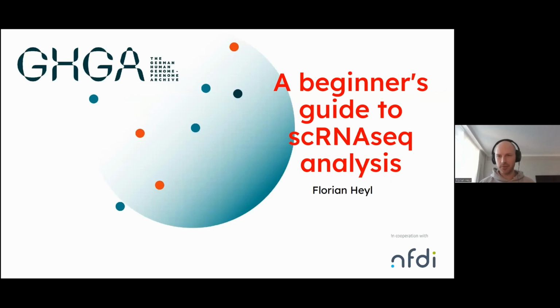Yeah, exactly. So I want to tell you some basics about single-cell RNA-seq analysis and the data. And I stress basics because single-cell is a very fast-evolving field, with many technologies still coming up, also with new tools and procedures.